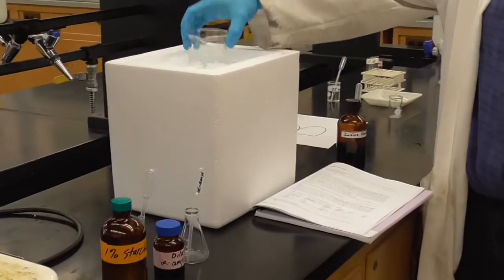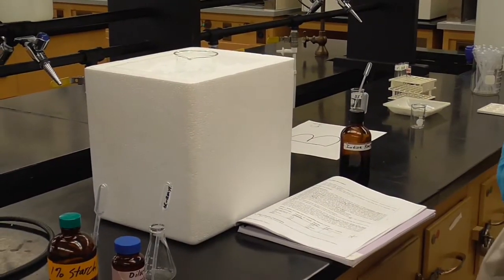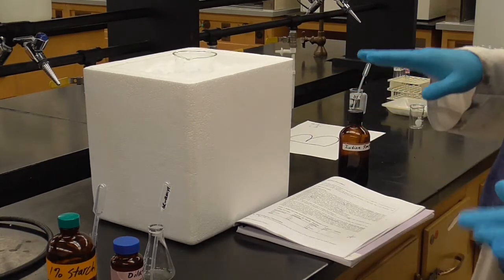Now our third condition will be over here, an ice water bath. So very cold, and I don't have a temperature probe on this one, but it's going to be just above zero, like 0.5 degrees Celsius. It's ice water after all. Right? So three conditions, three different temperatures.